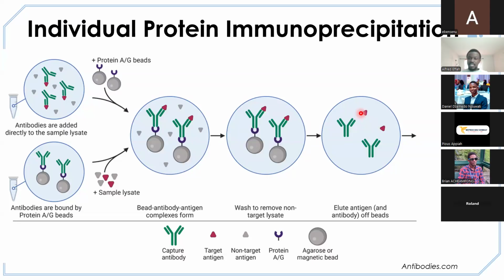How do we analyze? We can perform a Western blot whereby we use antibodies to stain or to react with this so that we can visualize it as a band. One thing you should take notice of: when you want to analyze, you should have an idea of the size of your protein of interest. So there's a ladder here. Now you can tell, let's say your protein has a molecular weight around 120 something, and this corresponds to your ladder, then we know that this is your protein of interest, and we are going to see a band here.